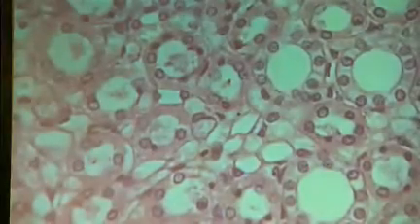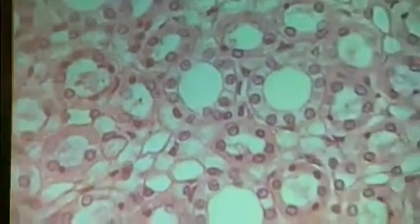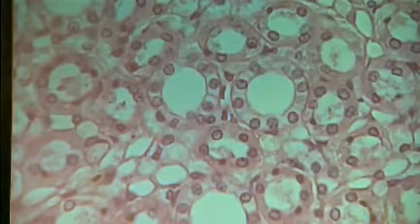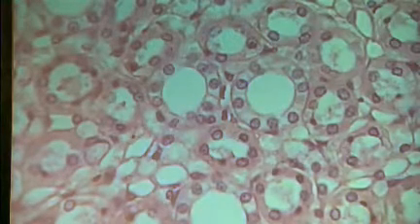Back to medium, and then I'm going to move down here. And so now we're in the cortex region. Now, this particular slide that I have here is just showing all the tubes cut this way. Okay? So that's what this particular slide is looking at. Now, when we look at this here, you guys remember looking at slides where we looked at simple columnar epithelial slides, right? Okay?